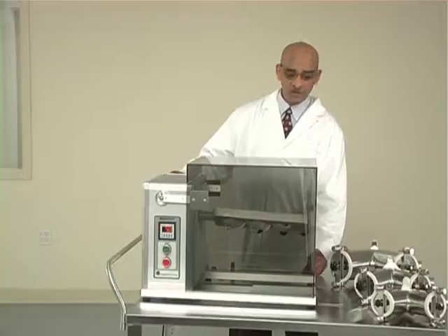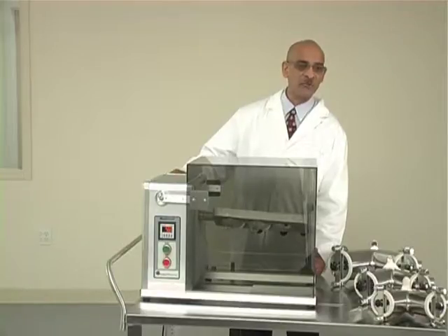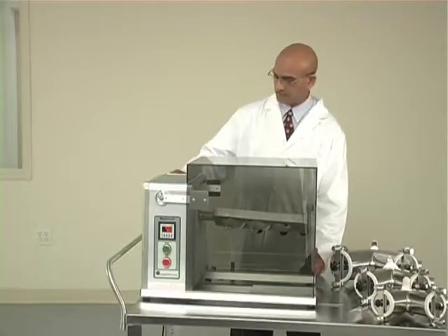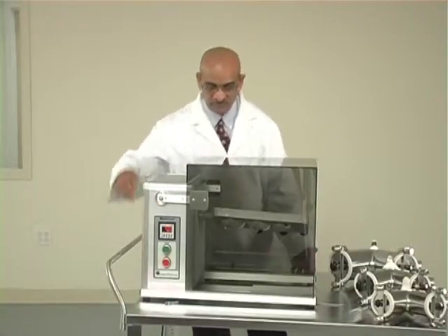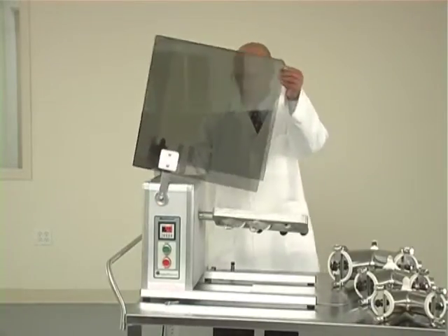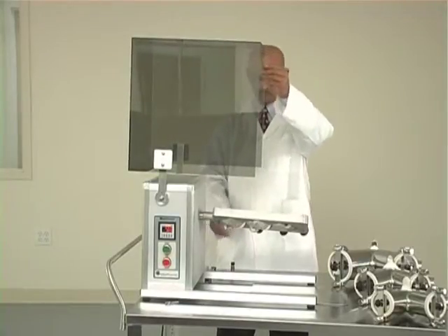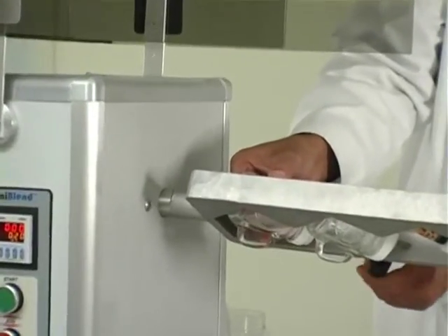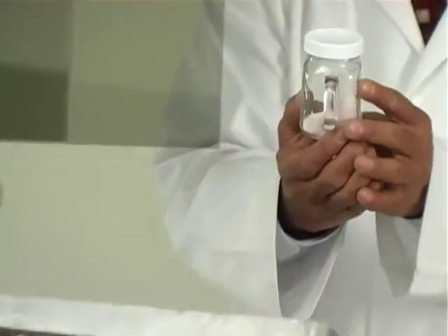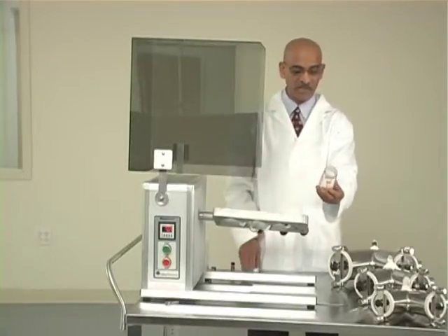We will now open the safety enclosure to remove the bottle and look at the blend to see how uniform it is. Open the locking pins on both sides, lift the guard up, put the locking pins back, and remove the bottle. This is the blend we have made.